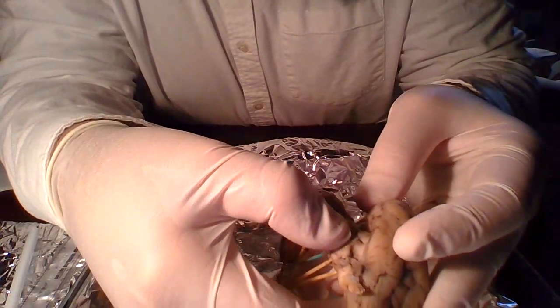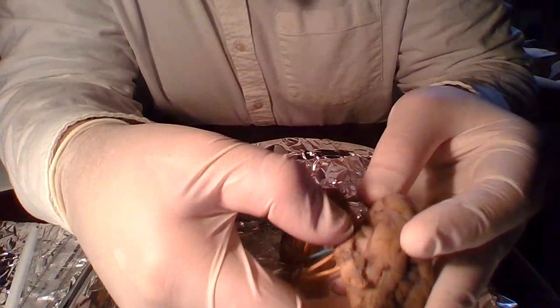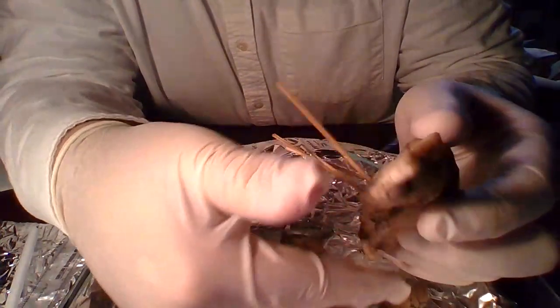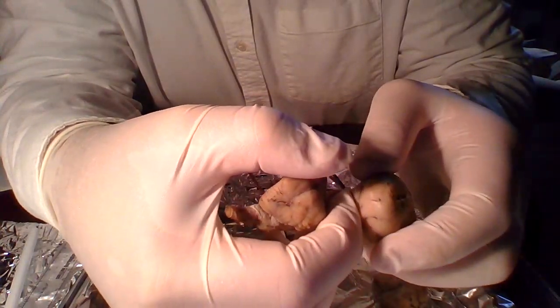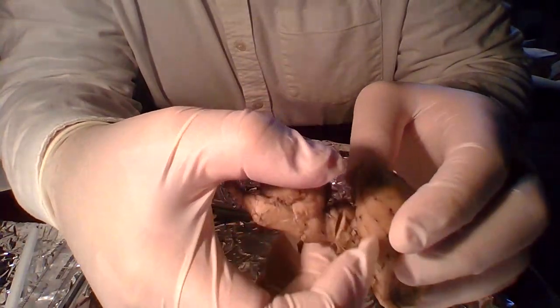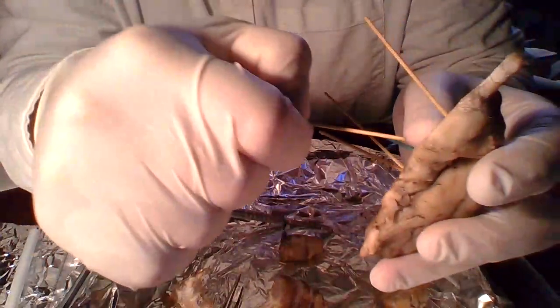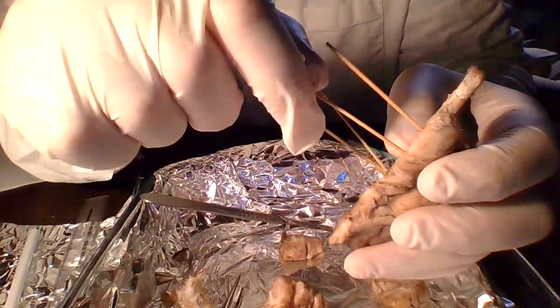Okay, so it's not exactly connected. It's a sulci right there. Big one, big old fissure. And it goes all the way around here. I guess this is how the ventricles attach to the rest of the cerebrospinal fluid outside. I'm gonna put you in with Elmer's glue, don't I?